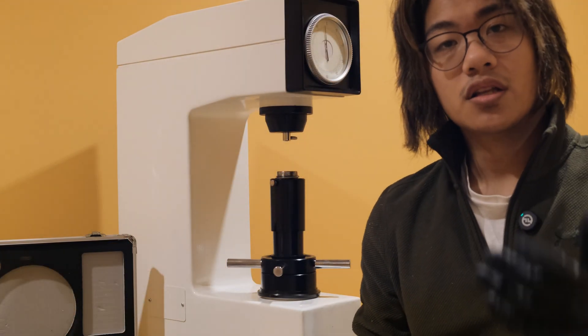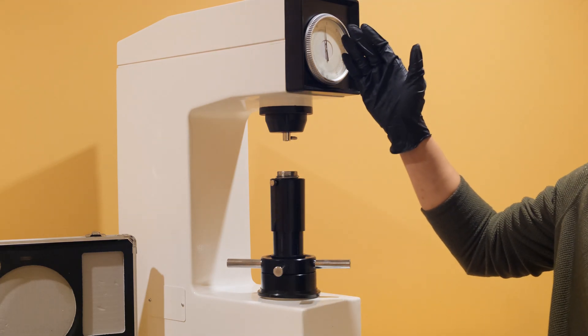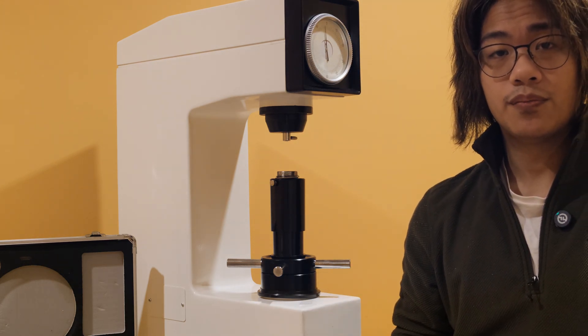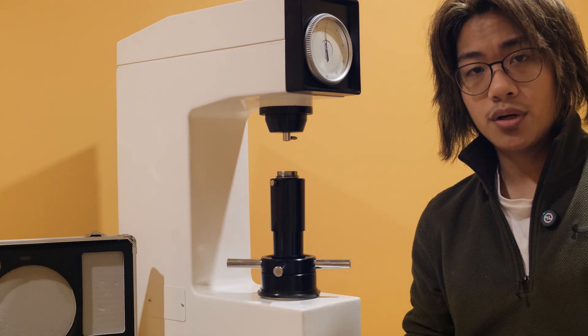Now let's move over to the operation of the hardness tester to see just how easy it is to take tests and obtain results. Check that the indicator is in the proper position, one to two points behind top dead center. Ensure that the correct penetrator, weight, and anvil have been selected.